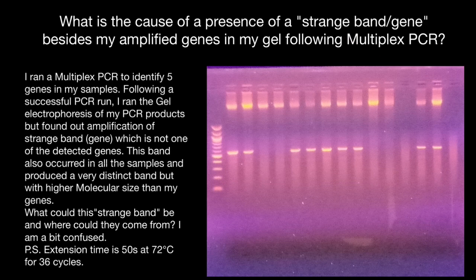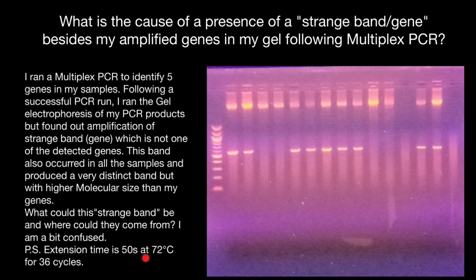I'm going to explain what multiplex PCR is for those who are beginners. I ran multiplex PCR to identify five genes in my samples. Following a successful PCR run, I ran gel electrophoresis of my PCR products, but found amplification of a strange band which is not one of the detected genes. This band occurred in all samples, produced a very distinct band with higher molecular size than my genes. The PCR scripting uses 50-second extension time at 72°C for 36 cycles.